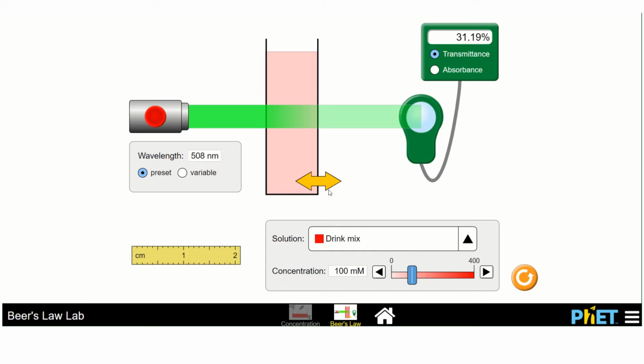I know you probably haven't heard of that, and that's okay. All it is, is a little tiny container, and it's typically made out of glass. So this is your sample in the cuvette, which is what step 2b is referring to.